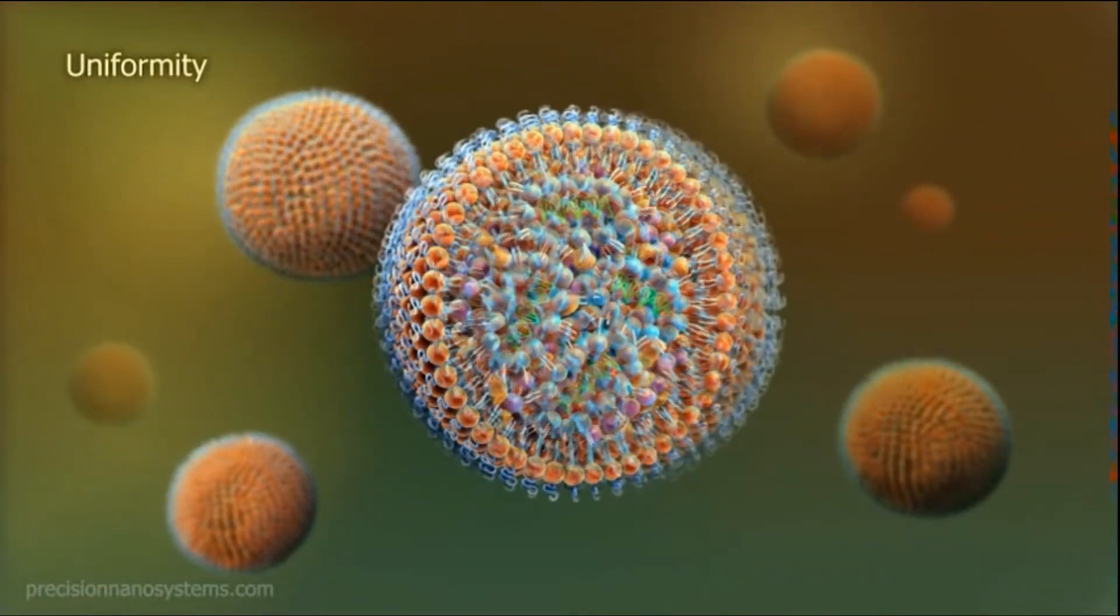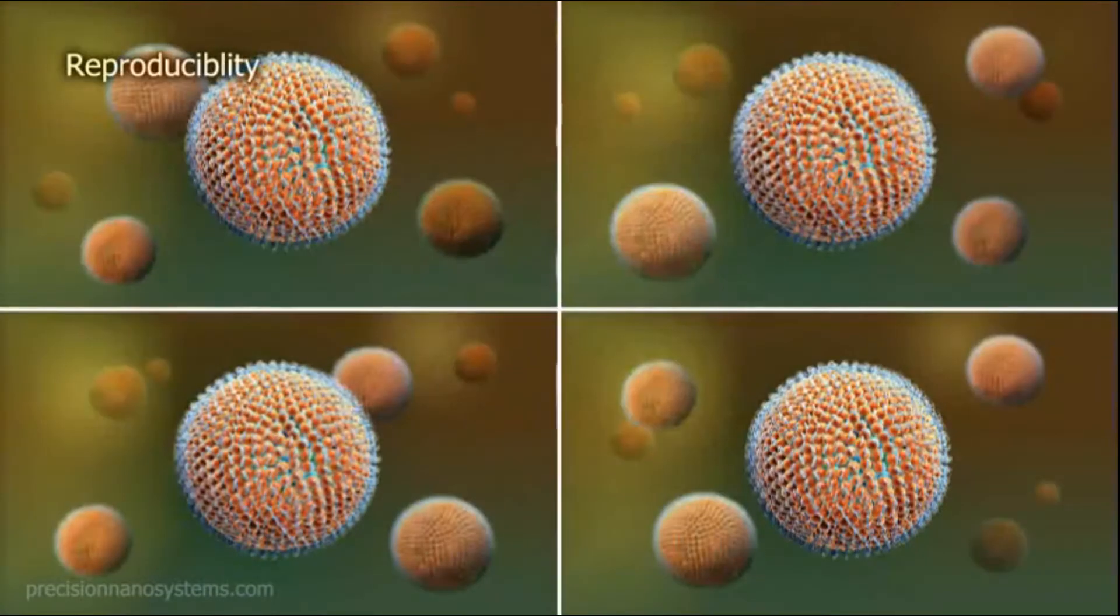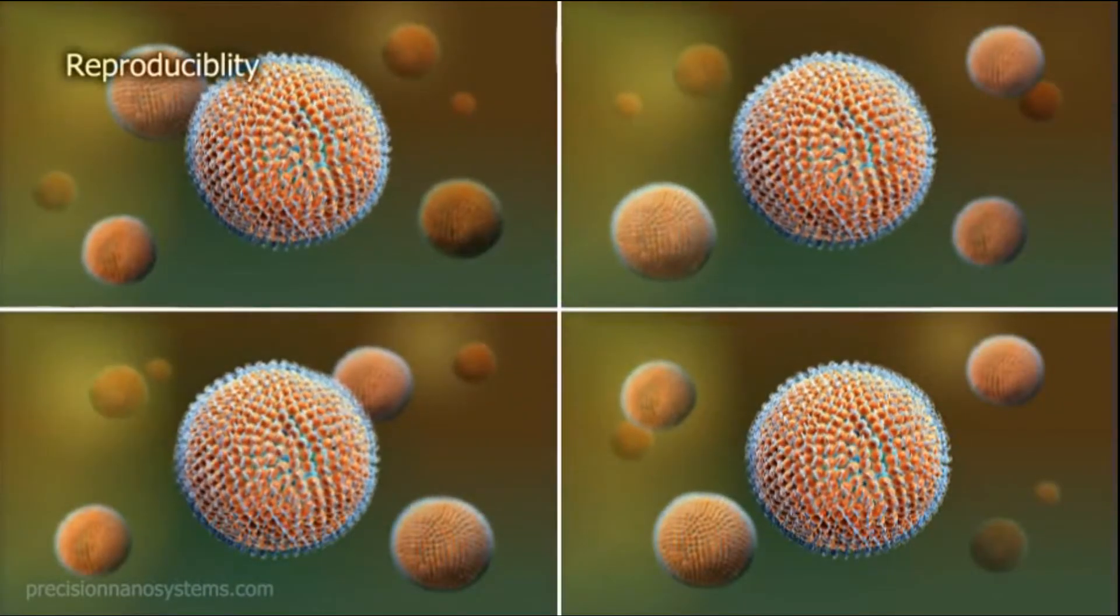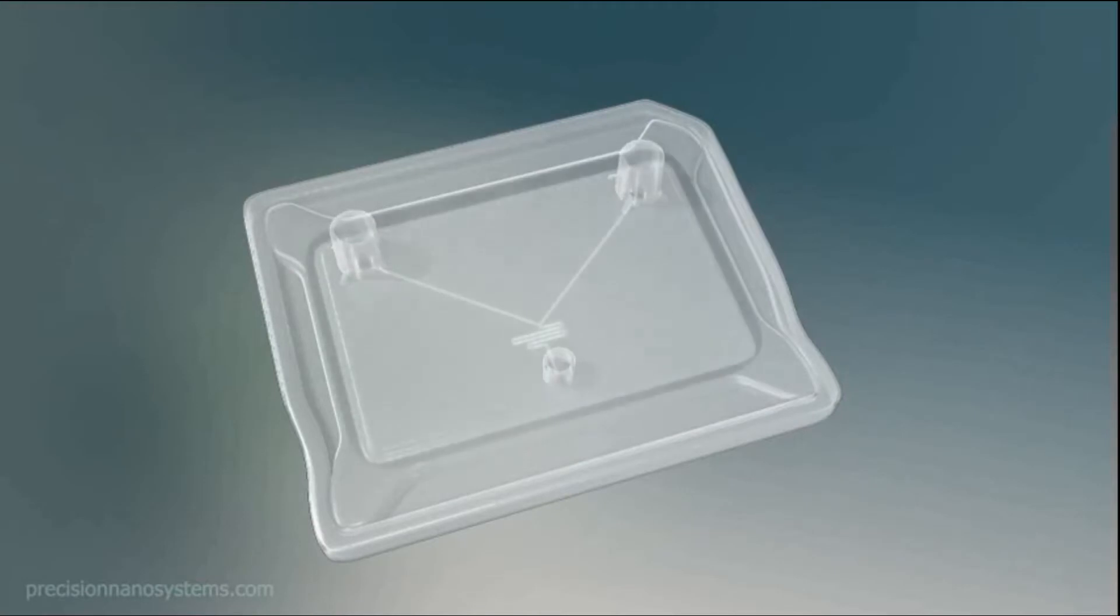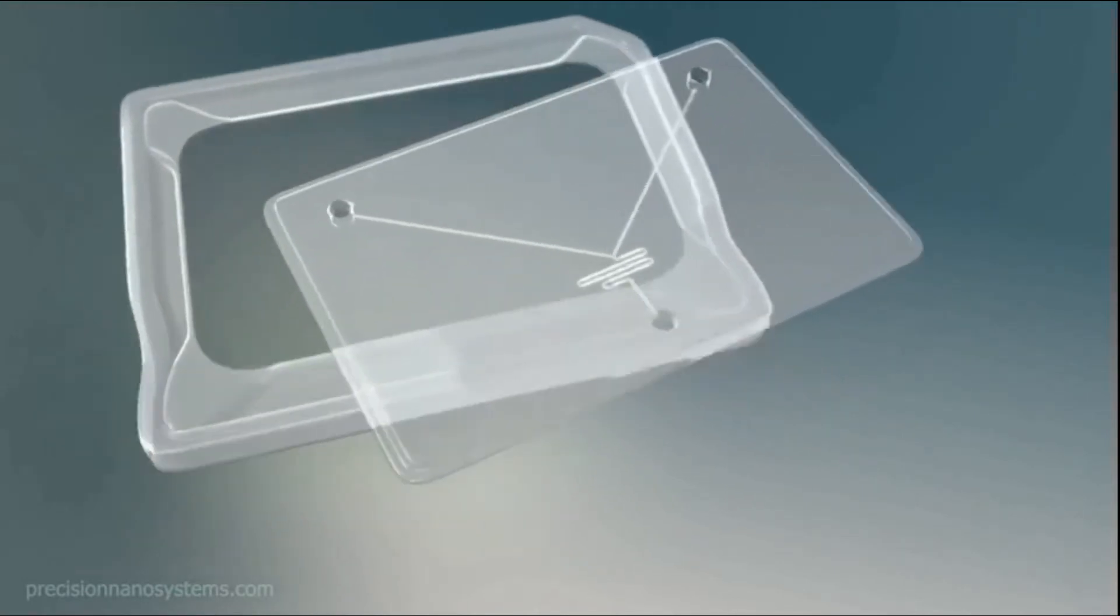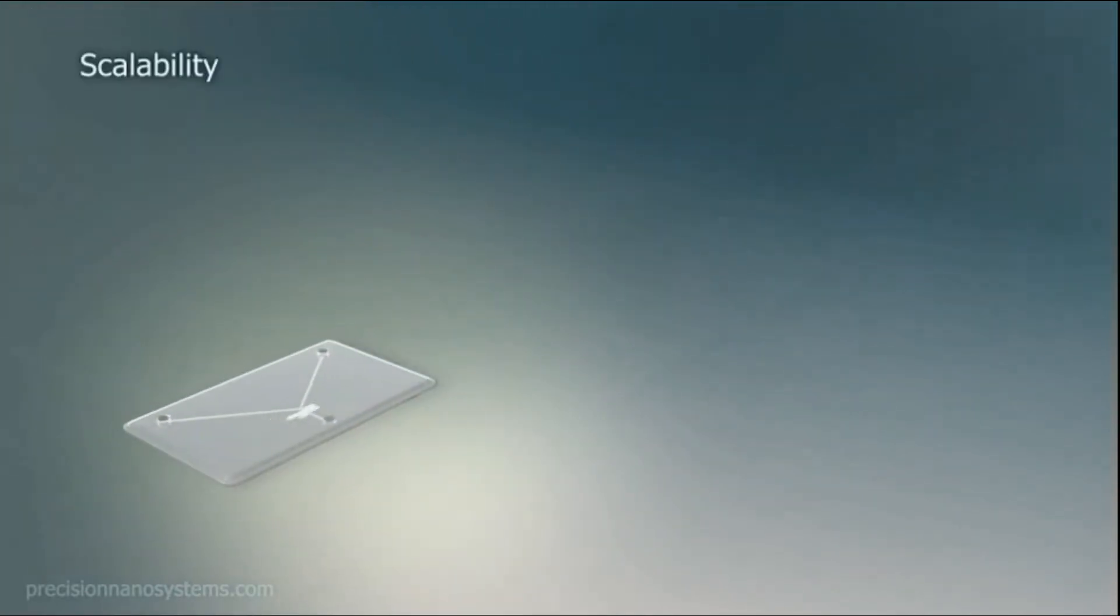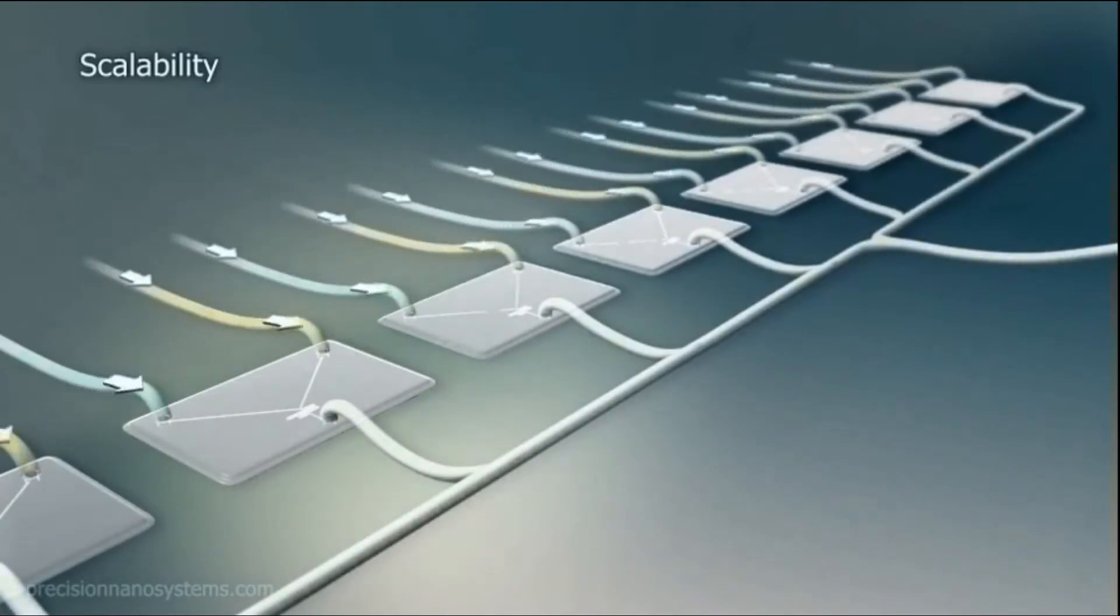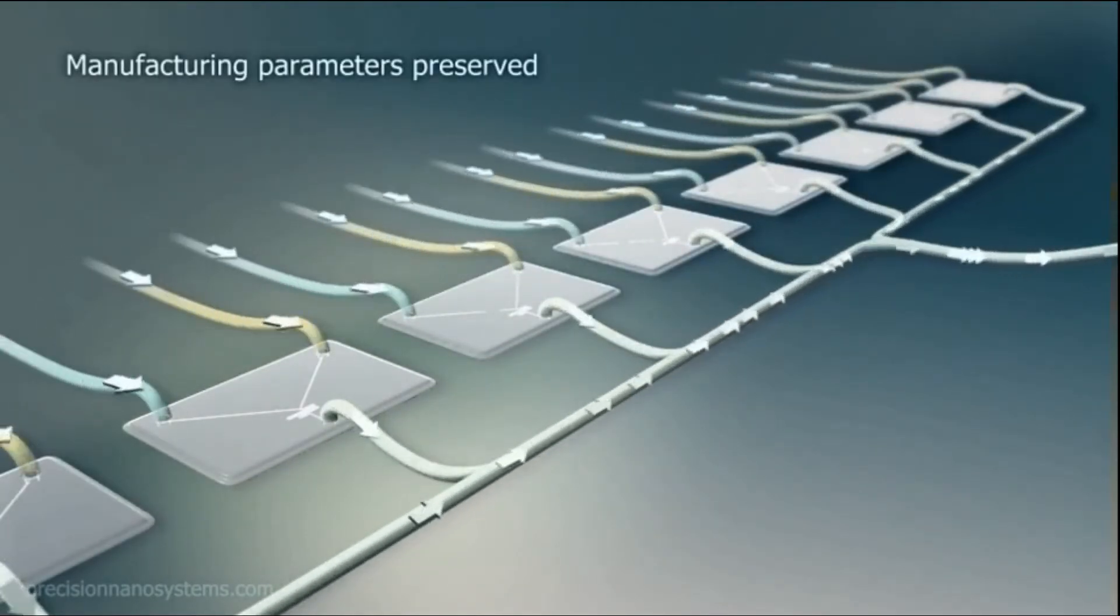The advantages stem from the microfluidic chamber. As the fluids mix, cationic lipids complex with the negatively charged nucleic acid to form the particle core. The helper lipids aggregate further, and the PEG lipids orient themselves on the surface with hydrophobic tails pointing inwards. This process creates uniform particles and is highly reproducible.